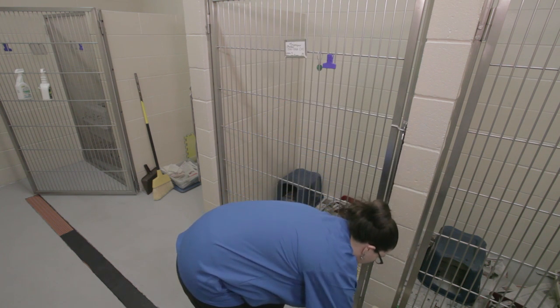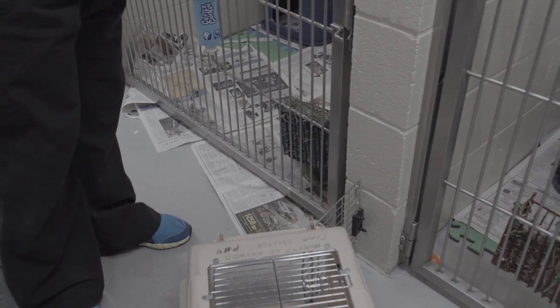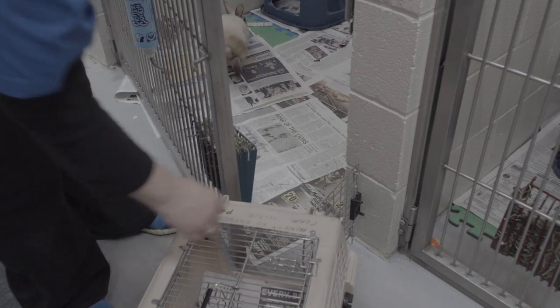Okay, so we're going to start with removing the bunny. Got a little cage here. Open the cage into the kennel there, so you can just hop on in or not.